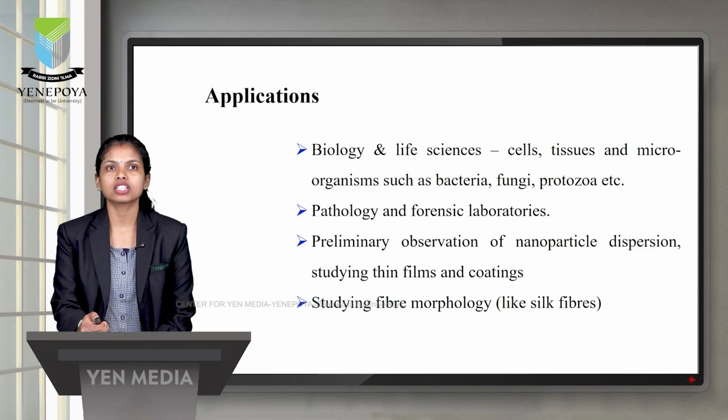Coming to the applications, it is widely used in biology and life sciences to view cells, tissues and microorganisms such as bacteria, fungi, protozoa, etc. Used in pathology and forensic laboratories to examine samples. It is used in preliminary observation of nanoparticle dispersion, in studying thin films and coatings, also to study fiber morphology like silk fibers, etc.